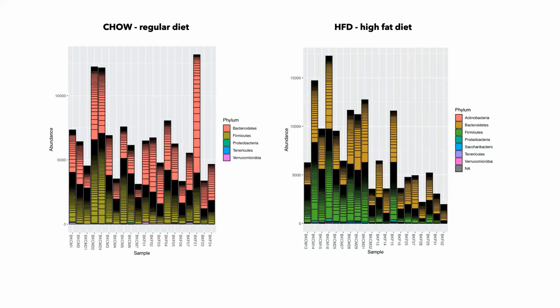Proteobacteria. Okay, so proteobacteria is right here. It is not very abundant here, but it is present in some of them. Firmicutes, so this has Firmicutes and this has Firmicutes. What does one of them have that the other one doesn't? Okay, Saccharobacteria, that's correct. Saccharobacteria is not even present here, which means that in terms of this scale of abundance, it's indistinguishable from zero.